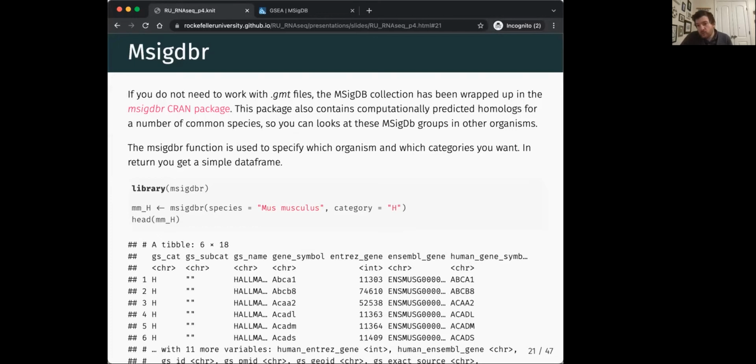So typically, I'd say for non-model organisms, there's normally a consortium. I cannot remember if there is one for ants specifically, but normally there's a consortium of people that work in ants who curate GO terms to help with that. Then, failing that, there are tools which help do ortholog analysis over longer distances to then do GO term analysis. So these would include things like Blast2GO and eggNOG.